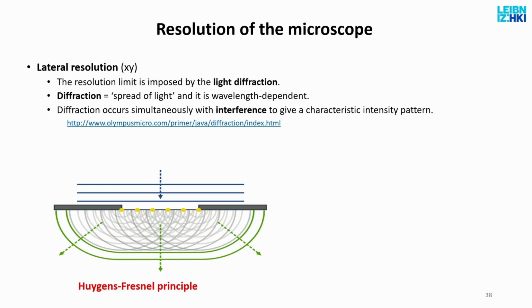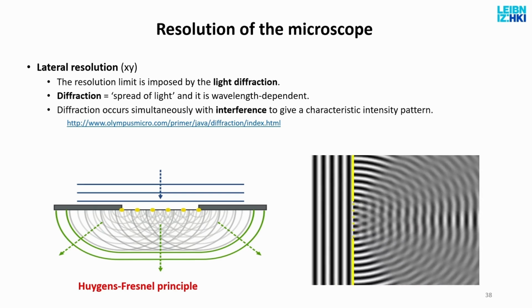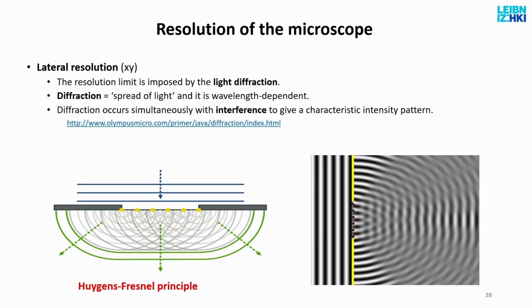So this means that if I hit a very small object, and now we know what size, 200, 250 nanometers, that size will work as a source of spherical light waves, which means I have the information that there is light coming from somewhere, but I don't know anymore what the source looks like. Because all the information that was carried here, intensity, shape, phase, is gone. All I know is that there is light. So this comes in, and then a randomish pattern comes out.